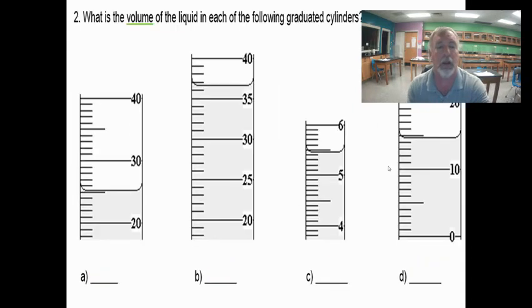Okay. So let's do some practice here. I've got some meniscus drawn on these. Now we know how to calculate our increments for each tick mark. So we're going to go through here. And again, I'm going to go fast for the speed of time. Hopefully, if you need to count these tick marks, please go ahead and do that.